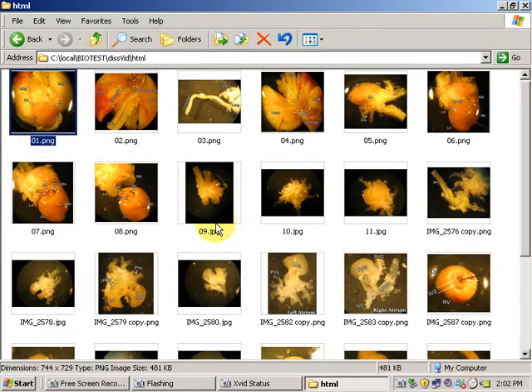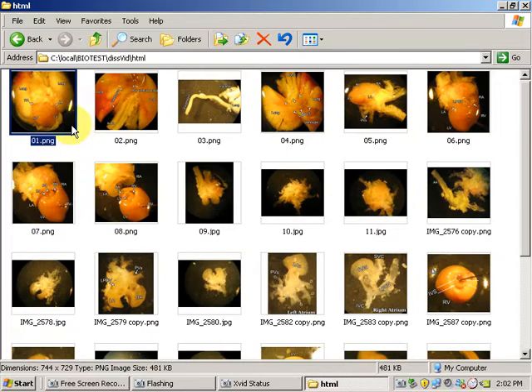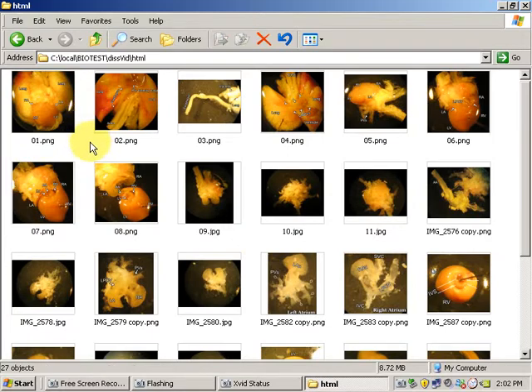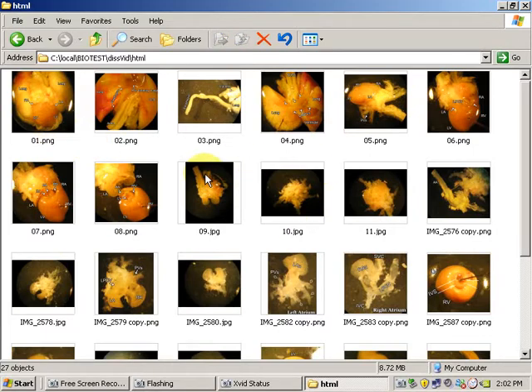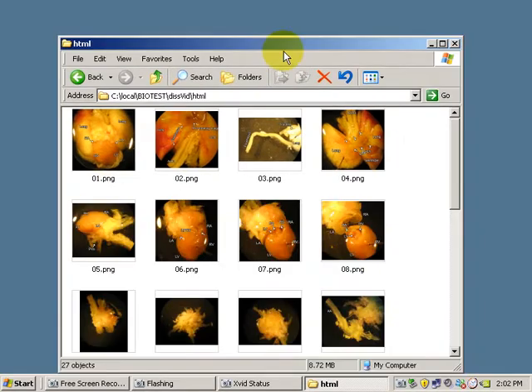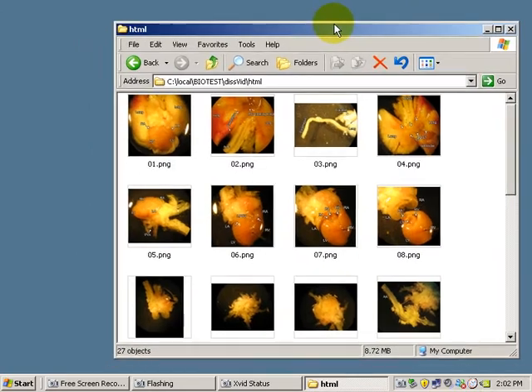Although I will keep the PNG files, which are very high quality files, on the hard drive that I'm going to store in the laboratory, I would like to post similar images on the web, and I want to quickly convert all of the PNG files to JPG files, and I can do this easily using ImageJ.